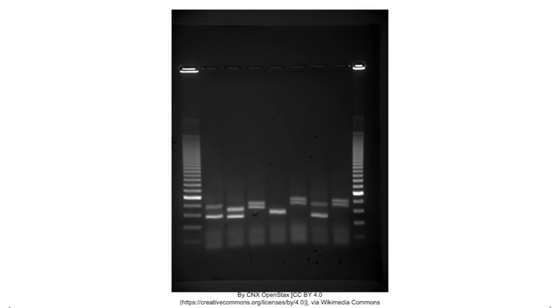This figure shows bands that represent DNA from gel electrophoresis. This can be found in Section 1 of Lab Techniques. Notice that there are several bands seen in this image. For example, this is a band, and these all are bands shown on this column right here. Each of the bands represent an amplified region of DNA. If the strand is brighter, it means that more DNA is present. So in this way, traditional PCR can be used to provide semi-quantitative results. In a second, we'll discuss an alternative way of performing PCR, which can provide quantitative results.